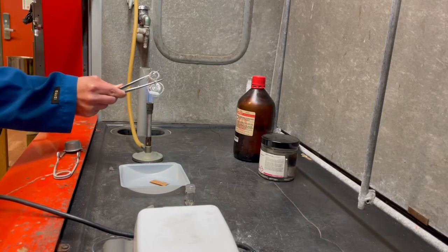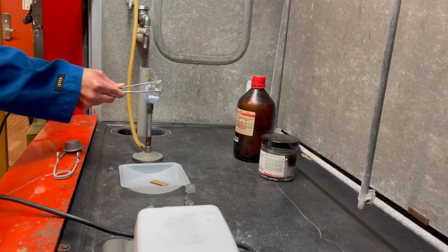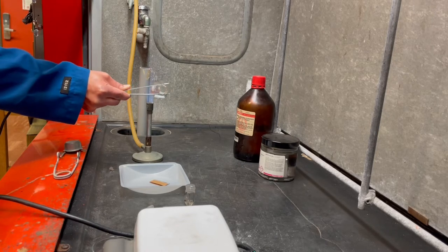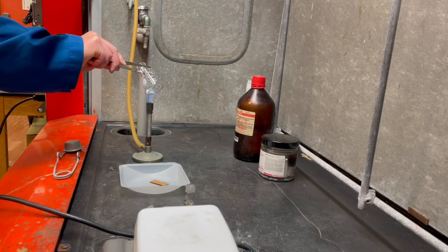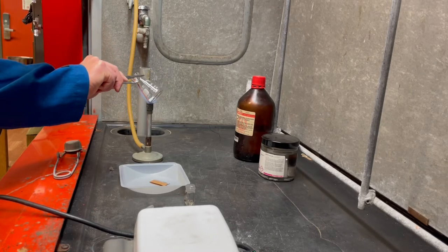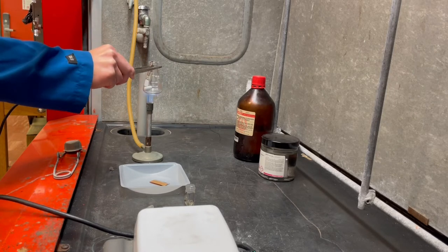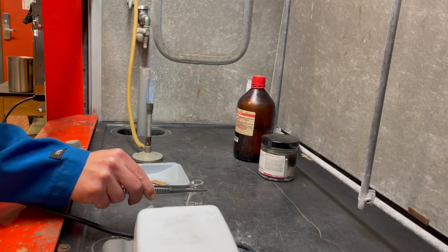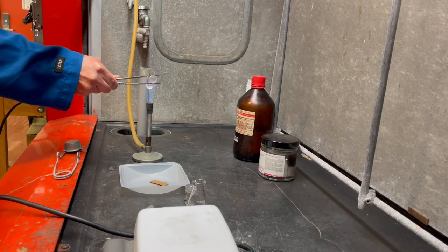So when it comes to this type of stuff, I would put this in the day before, because I'm planning a reaction tomorrow. And then you can also assemble the glassware once it cools off from the oven, and then you can pull a vacuum on it and hit it with a torch as well. If you really need to make sure that water is not present in your reaction, this is the way to do it. Obviously we don't have that option for our setup.